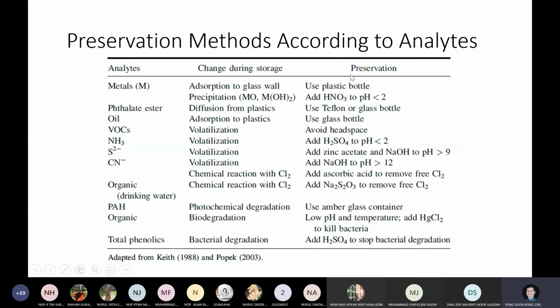Because if you have seen a real Teflon vial or Teflon bottle, it's actually white in color. Teflon is just like any other plastic. It's transparent, possibly a little bit whitish, but the reason why Teflon is used here is that nothing can stick. So it minimizes the error of contaminants sticking to the wall. Everything is coming out in the liquid phase or whatever.